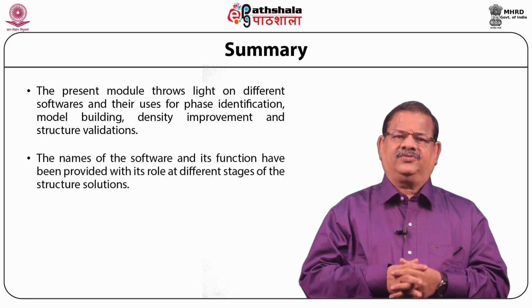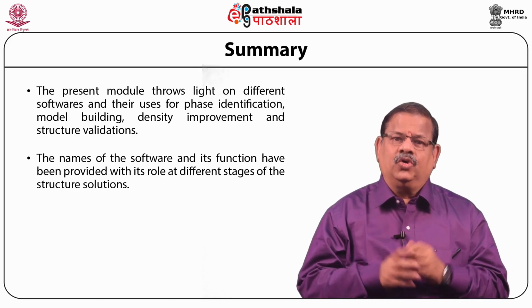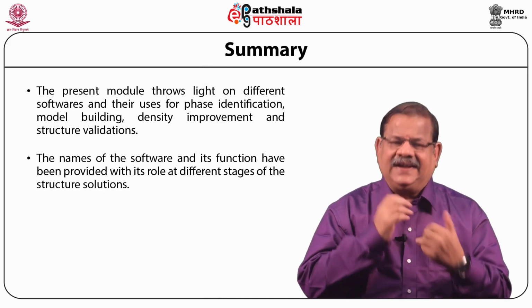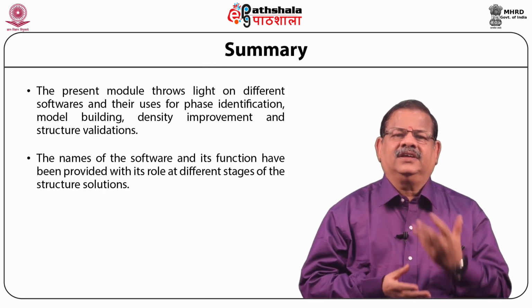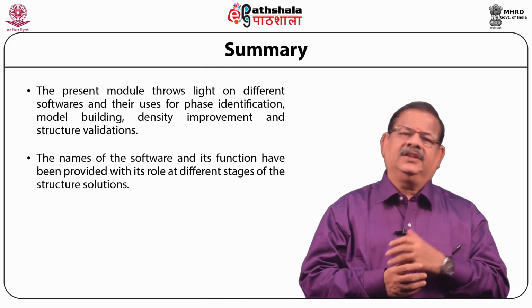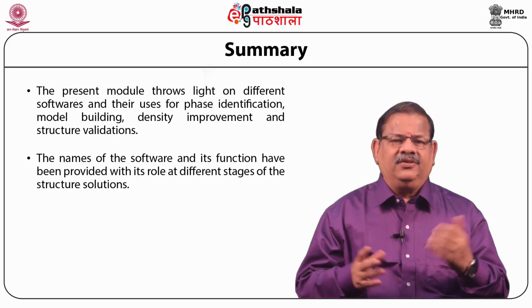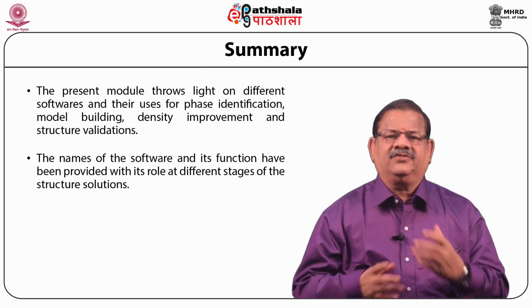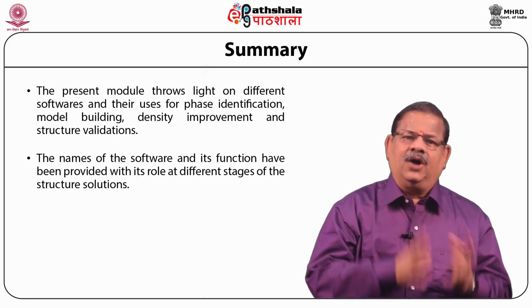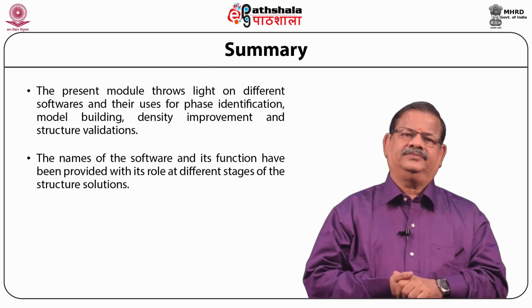The names of the software and its function have also been provided with its role at different stages of such a solution, starting from data reduction and applying the thermal factor corrections, calculation of normalized E structure factors, E values, then rotation function, translation function, the molecular replacement techniques by various programs, then your starting phases from your solve program, and how these phases can be used for phase extension and modification and so on.